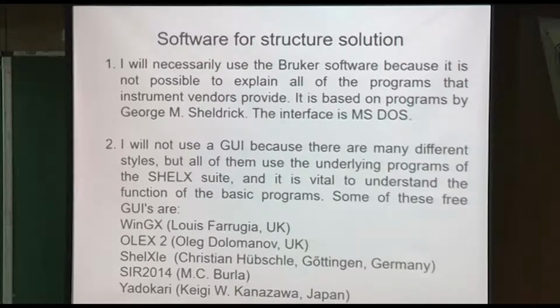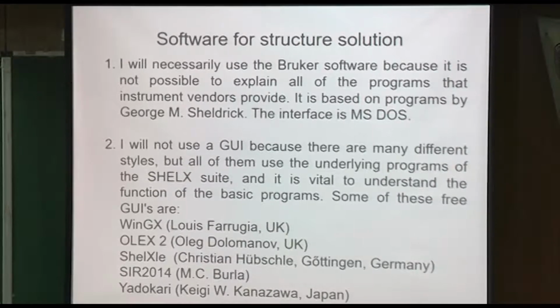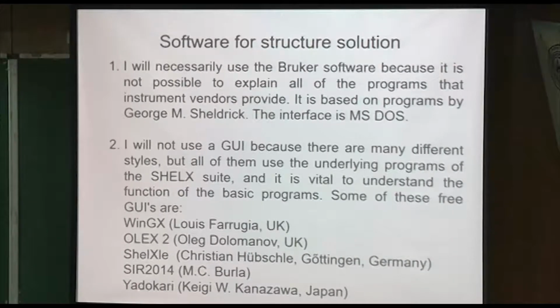SHELXle I've played with a little bit. It's very nice, actually. The person who wrote it worked with George Sheldrick for a long time, so he's incorporated the Sheldrick software. But it can do some automatic things for you, like updating the weight as you refine and things like that. Then for structure solutions, SIR2014. Maybe there's a newer version now, I'm not sure. This student who visited me from Japan used a program called Yadokari. I don't know if you've ever heard of that. But there's many of them. People have written them over the years. Different countries probably have different ones.